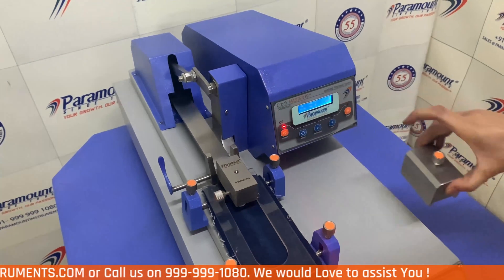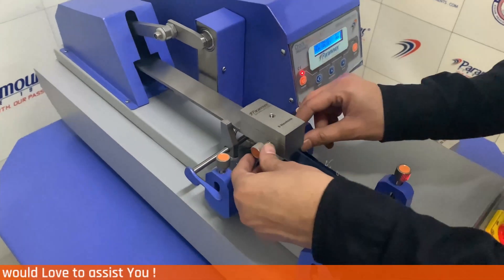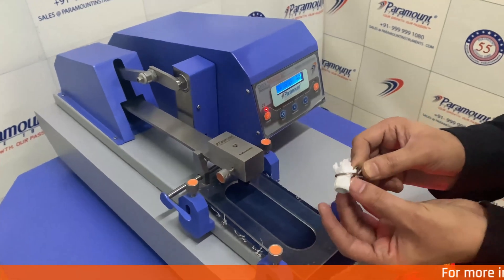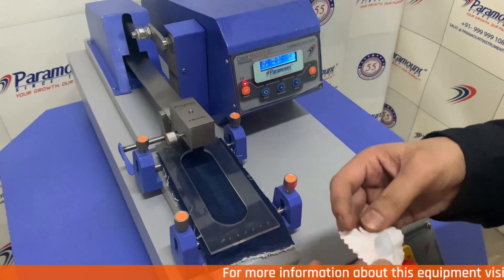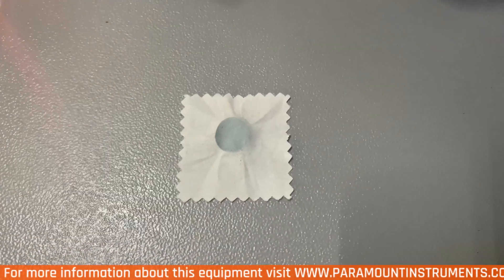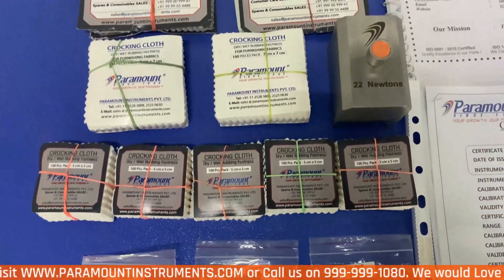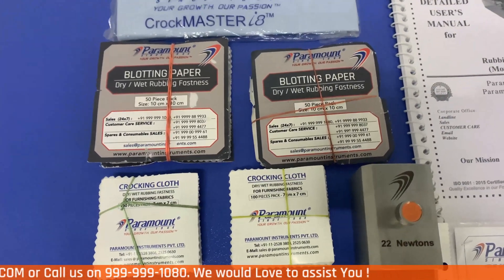After the test is finished, unscrew the weight and lift off the finger with the help of the lever. Then carefully remove the crocking cloth and place it under well-lighted condition to inspect the results. Every Paramount CrocMeter i9 Digital comes with these accessories so that the customer can start using it without any inconvenience.